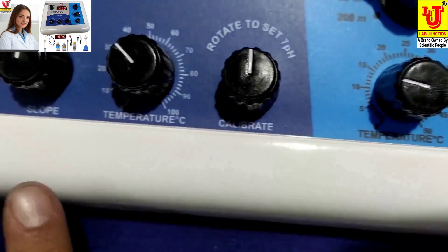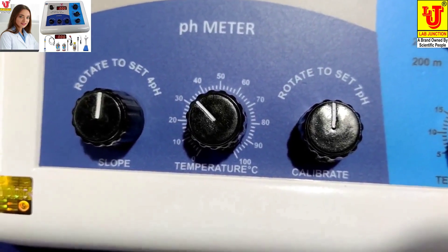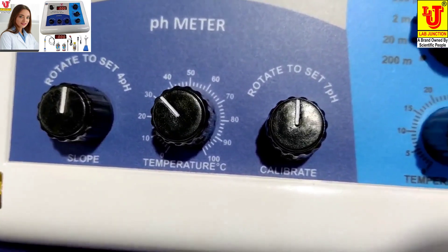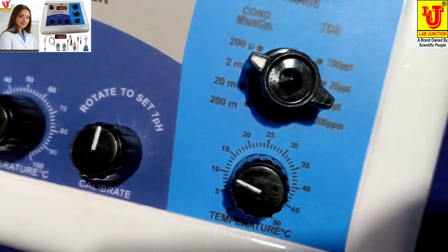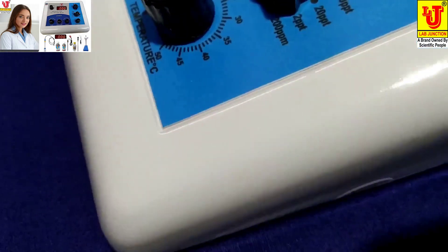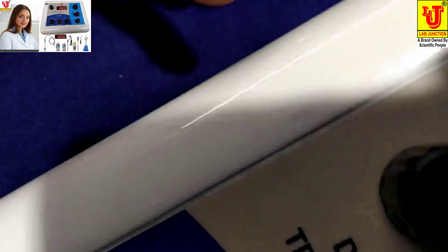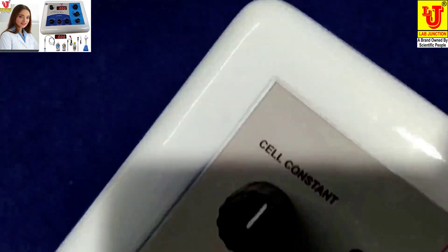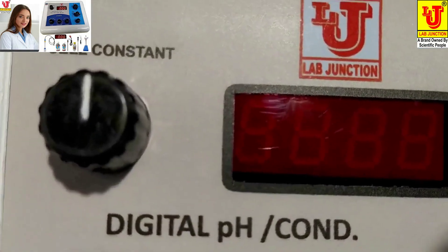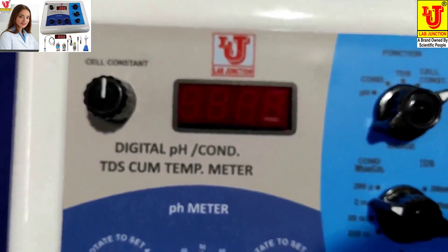And these three knobs are for pH. One is 4 pH, one is temperature setting for pH, and one is 7 pH for calibration. And this control is for cell constant — for feeding the cell constant, conductivity, and TDS values.